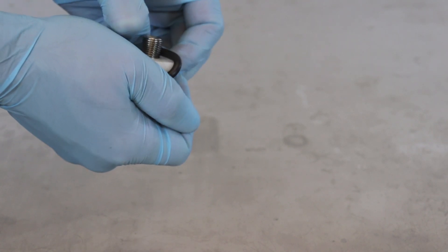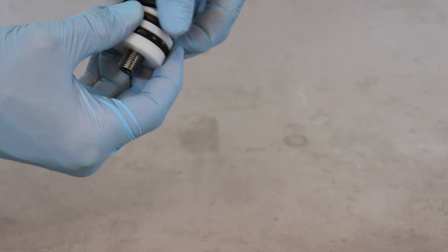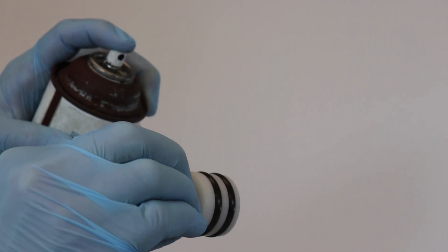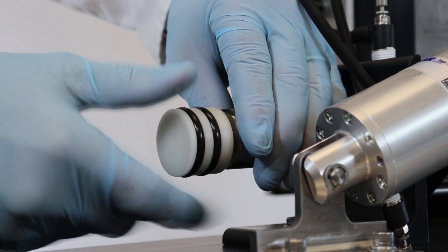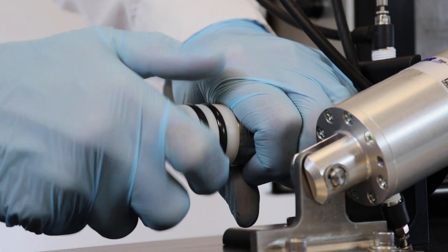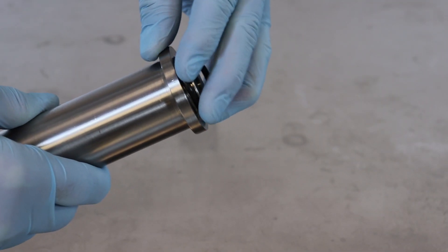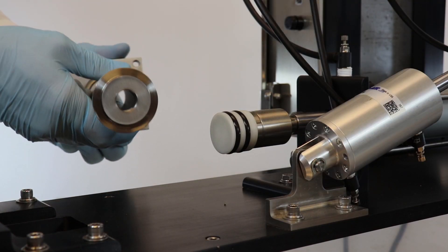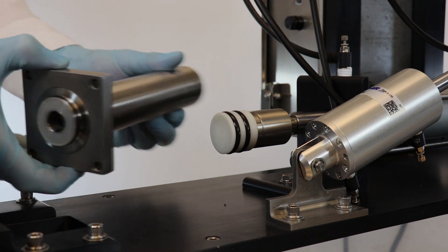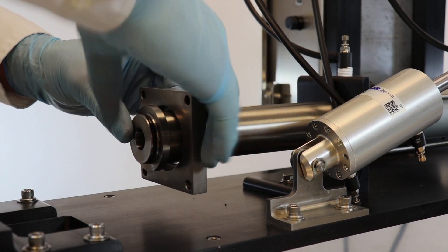Place two number 318 Viton O-rings into the notched grooves on the Delrin piston head. Spray the piston head with silicone. Screw the piston head onto the rod coupler and use both hands to make the fit snug. Place the number 218 Viton O-ring into the notch on the end of the piston sleeve. Place the piston sleeve through the mounting plate before sliding it over the head of the Delrin piston head and rod coupler. Slide the sleeve as far back as you can to make enough room to attach the block assembly.